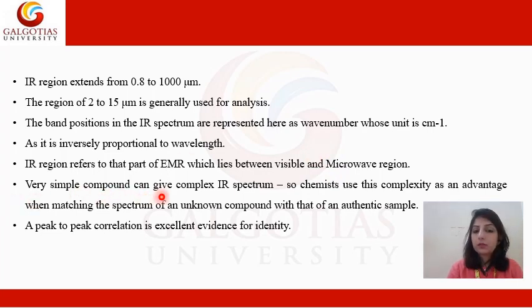Even a very simple compound can give you an IR spectrum. We can use IR for the determination of functional groups, and each compound can contain a number of functional groups. So the spectrum that is generated after the analysis is quite complex.